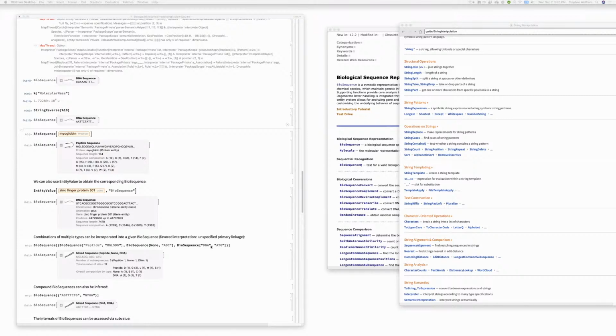Okay, so do the Emerald folk have a comment on this? In our syntax, this would mean that the three pieces are conjugated together in some way. We don't currently have a way to specify that. That's something we talked about for the future. So it would be kind of implicit if there's DNA next to RNA. Physically there's something in the middle that makes the interaction happen, but they are physically bound together in the way that we represent it like that. Would that be a linear sequence, or some kind of binding of one strand to the other? It would be linear, end to end. The binding between strands with the hydrogen bonds and so on is done through our secondary structure specification, through the bonds.